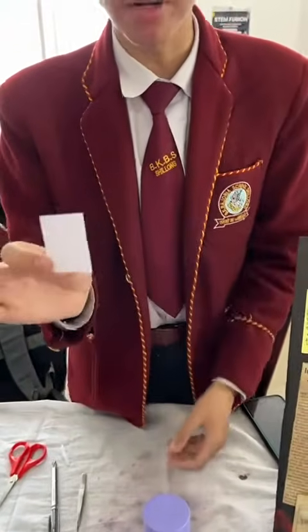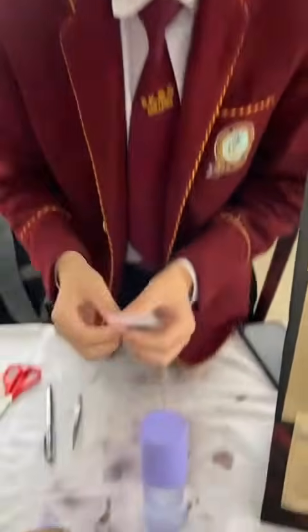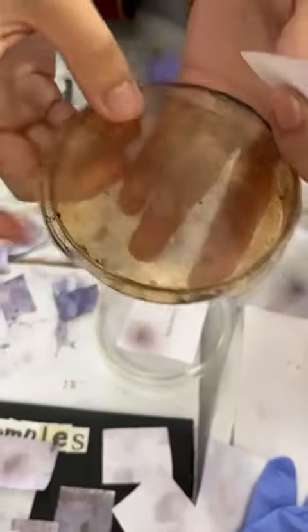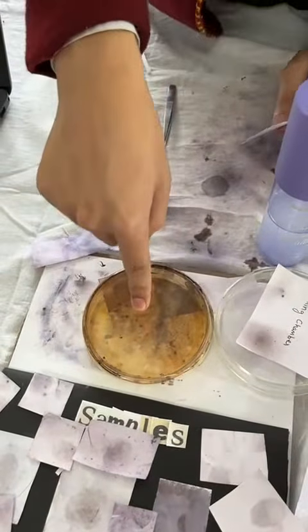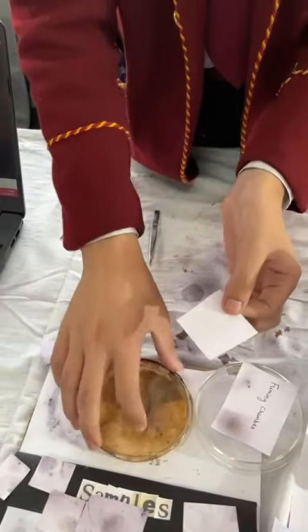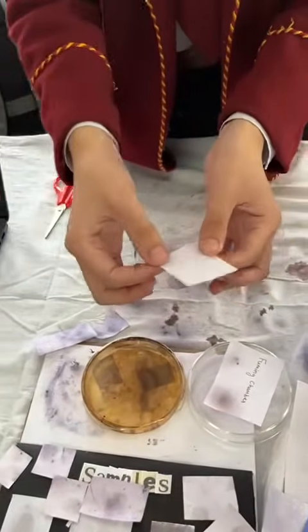Now, right now, there's a problem. There are fingerprints, but we basically cannot see them. So this is where the technique comes in. What we do is we take iodine. You can see this is iodine, and this is all made possible because of the property of iodine. The property of iodine is that it changes directly from a solid to a gas, and in that process, if I keep this inside of this fuming chamber, the brown gas or brown fumes of iodine go and attach to the oil present in this paper.